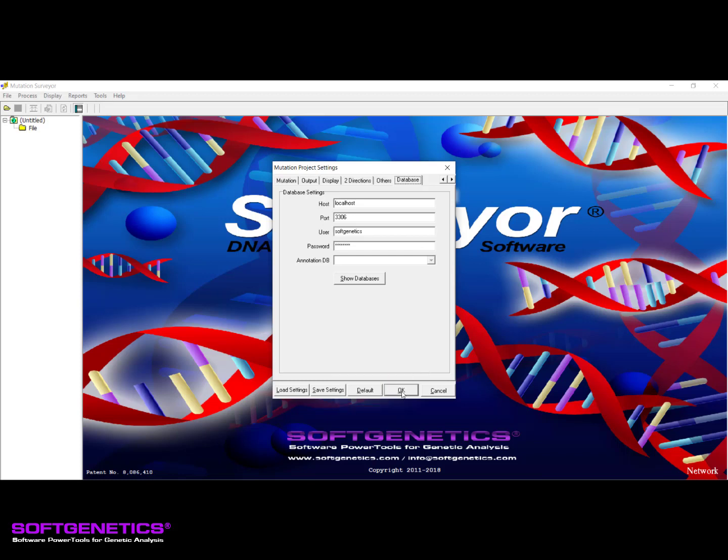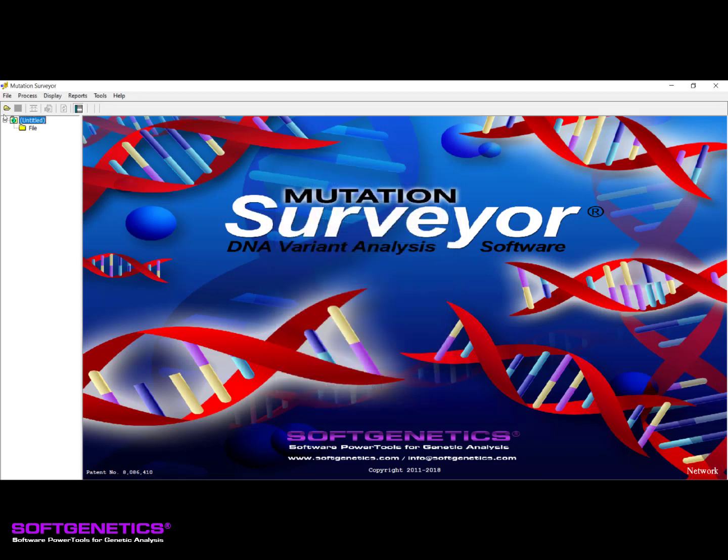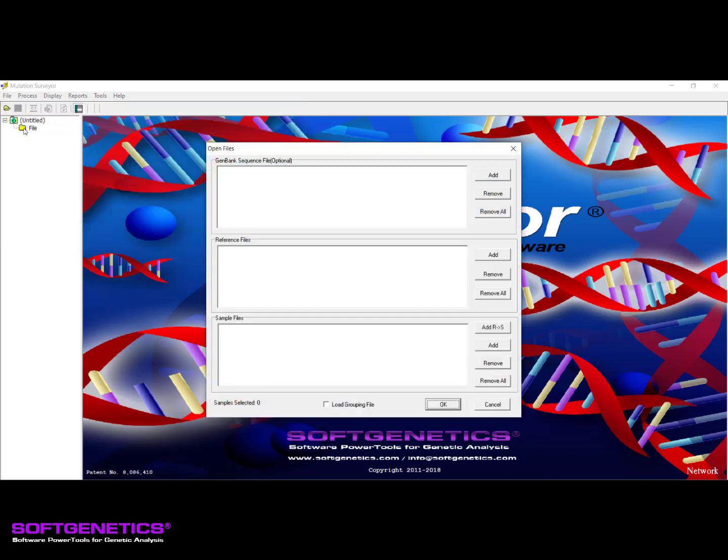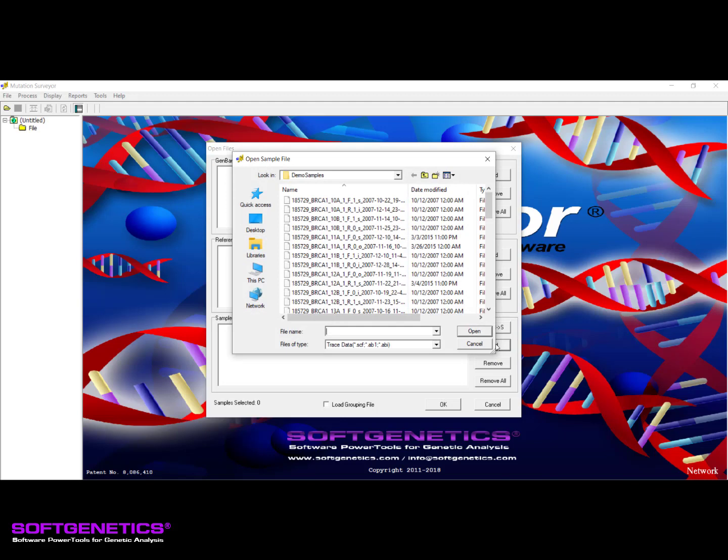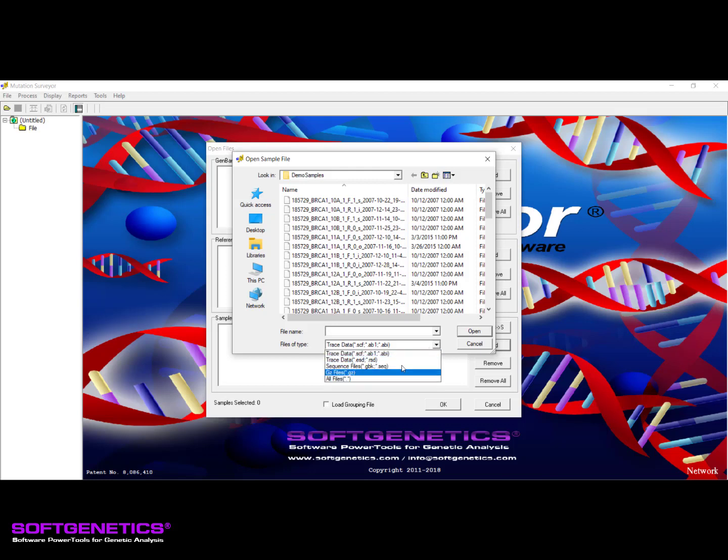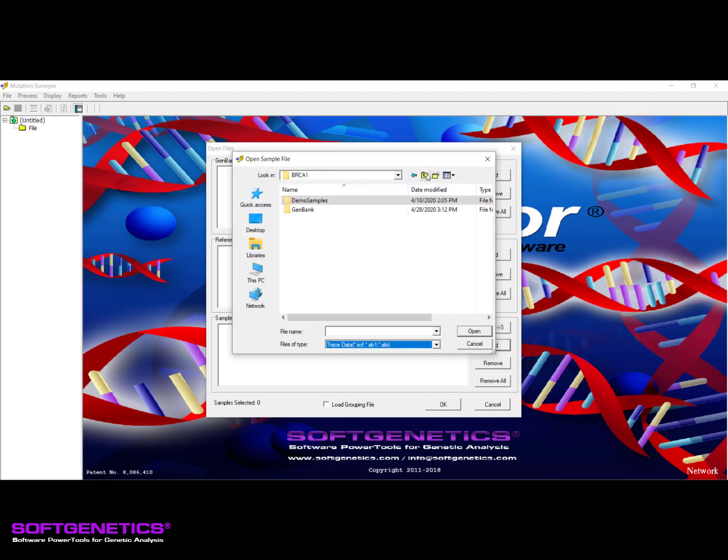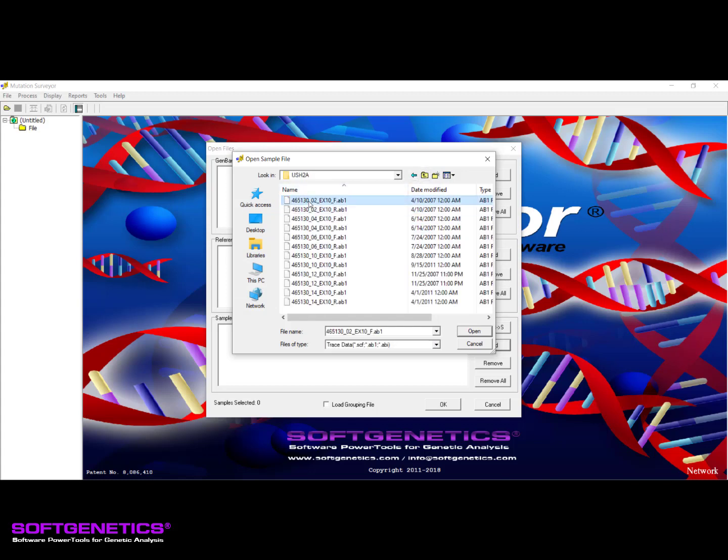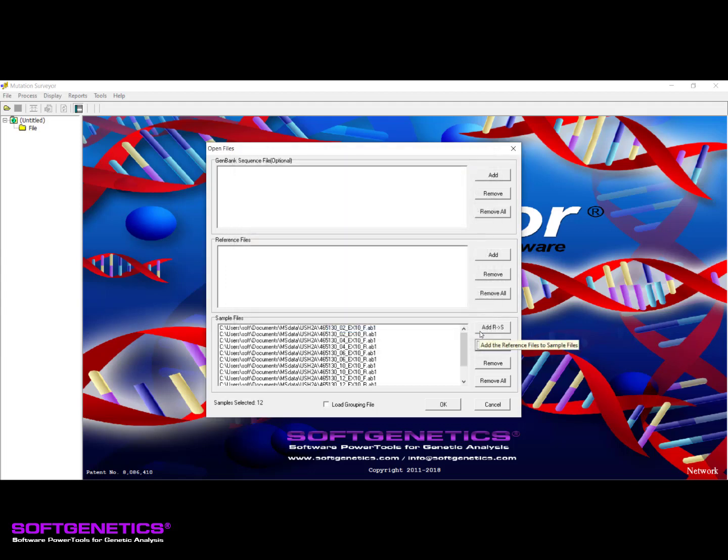Once the preferences have been set, it is time to load the data. We do this using the Open Files dialog, which can be opened by clicking the folder icon located in the top left corner or by going to File, Open Files. To load the sample files you wish to have analyzed, click the Add button to the right of the bottom Sample Files field. Mutation Surveyor supports trace files from any of the major sequencing platforms such as Applied Biosystems and Beckman. Use the default file type or use the dropdown to select the preferred type of file. Select your samples to add and click Open. Up to 2,000 sample trace files may be loaded per project depending on the Purchased License option.